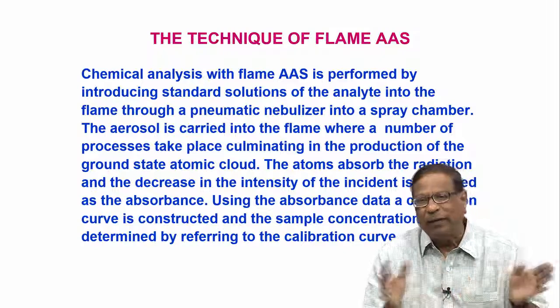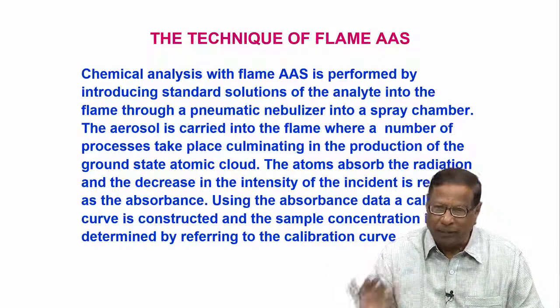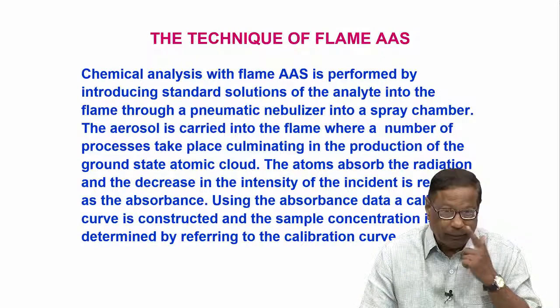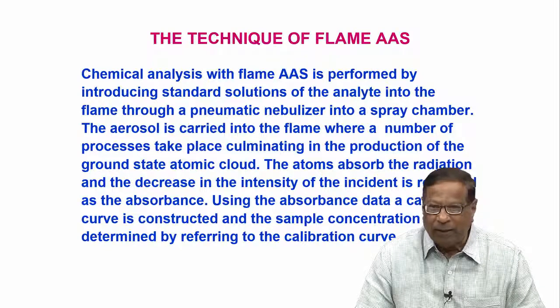Therefore, the intensity of the hollow cathode lamp decreases whenever there is absorption. The absorbance of the given sample corresponds to Beer-Lambert's law, which we derived earlier.